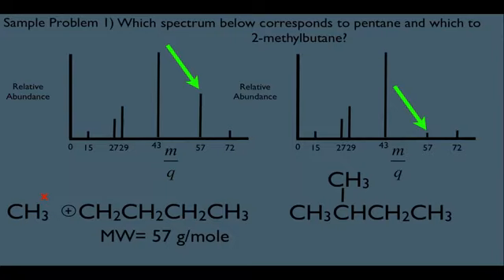Now let's look at the 2-methylbutane. Again, we could shoot an electron beam, and most likely this would be the methyl that is broken off. Why is that? Well, the resulting species would look like this, making the bottom species detected by the mass spec, and therefore giving a peak at 57. Notice if we broke this bond, we would get a secondary carbocation.